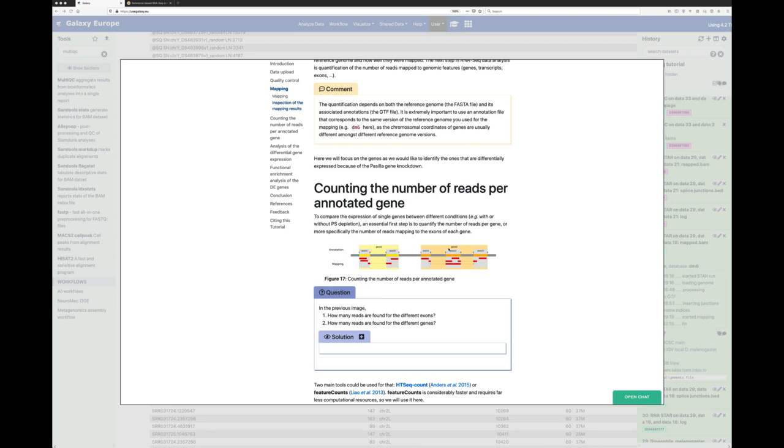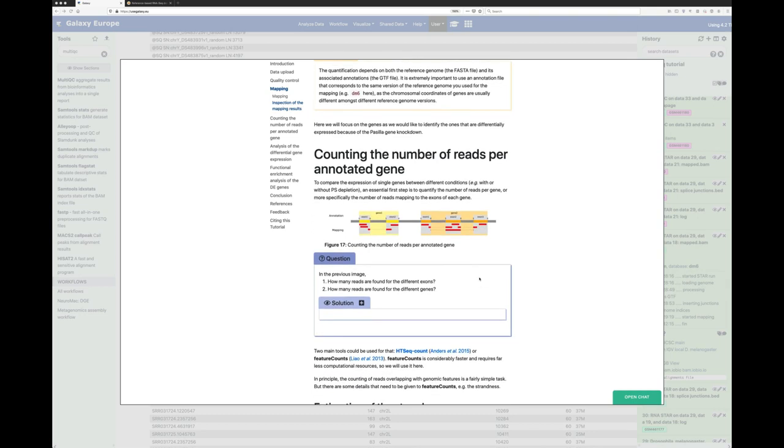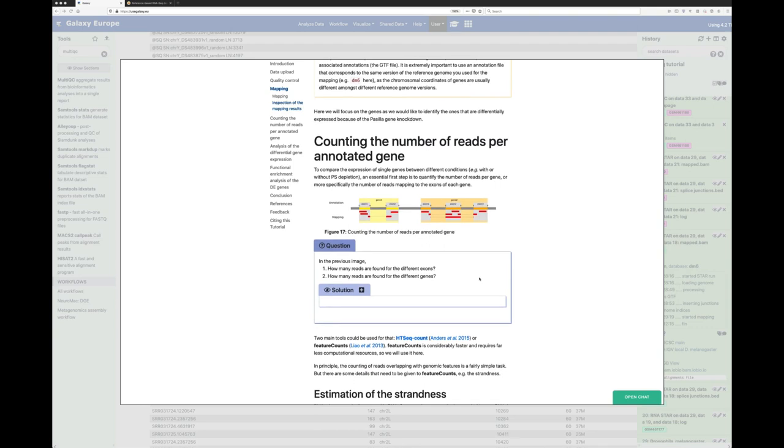And here for gene 2 it's the same, because we have 1, 2, 3, 4, 5, 6 and not more. So we need to be careful when we do the counting, not to count the different reads inside the genes twice, by taking into account the exons and the reads that span over the different exons.